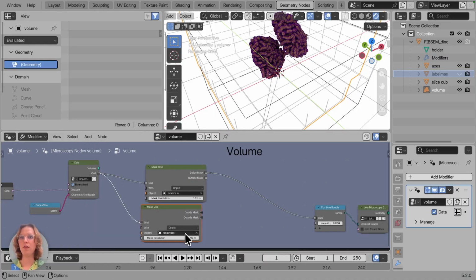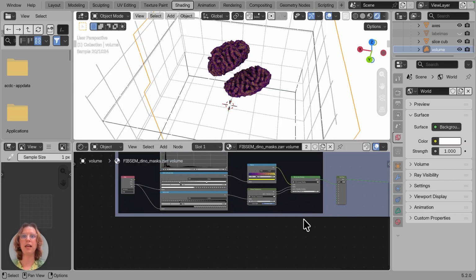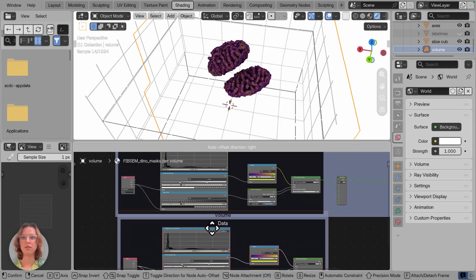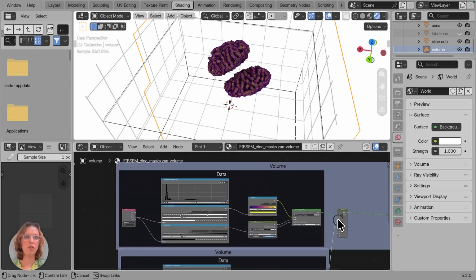Put in the grid and we put back in the slice cube. And then make a new channel that is the exact same as everything in here, except that it pulls data slice cubed. Add this to our sequencing.